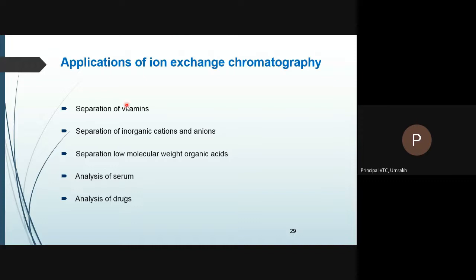In pharmaceuticals we are using this. The application of ion exchange chromatography is very wide. It is not just used in the pharmaceutical industry, it is used in other industries and chemicals, as well as for softening and demineralizing for household use. So that is about ion exchange chromatography.